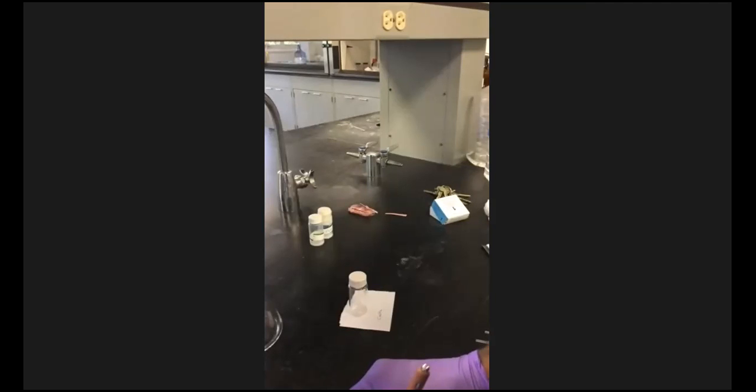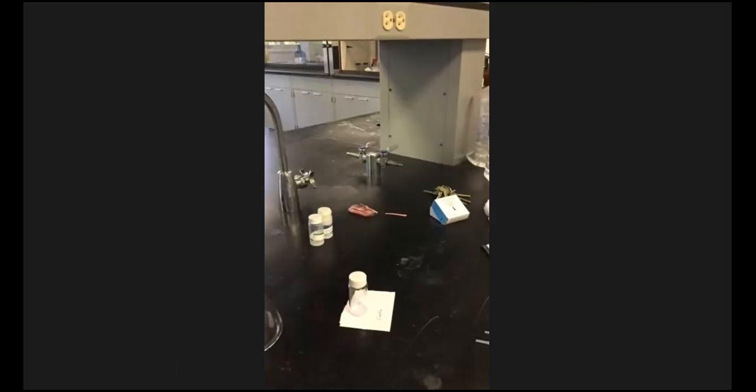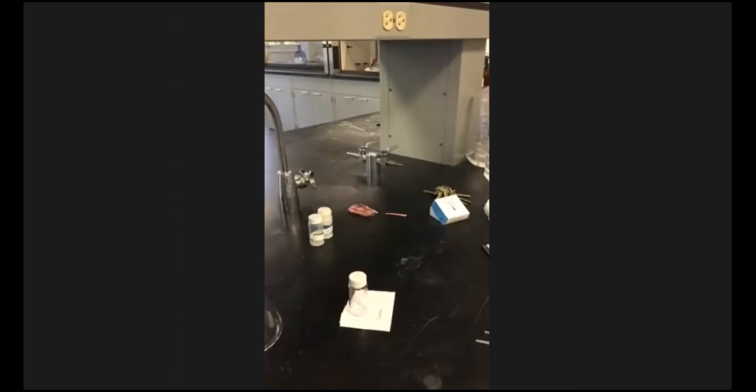I have a question. Go ahead. Did we ever do the mass of the air dry thingy, or no? No, we can't do that until after we filter it. You understand what I'm saying? The air dry filter paper is the filter paper plus the calcium oxalate that we made in this experiment after it's sat and dried for a while.